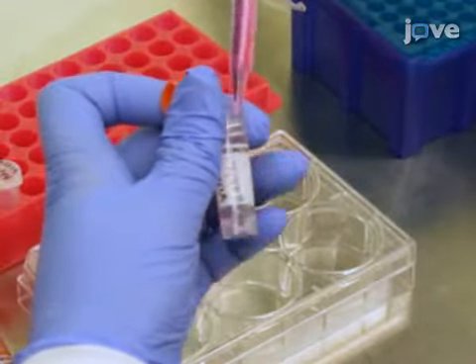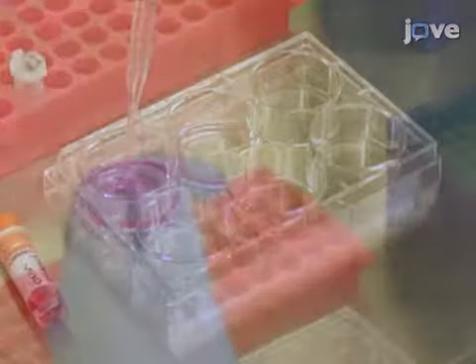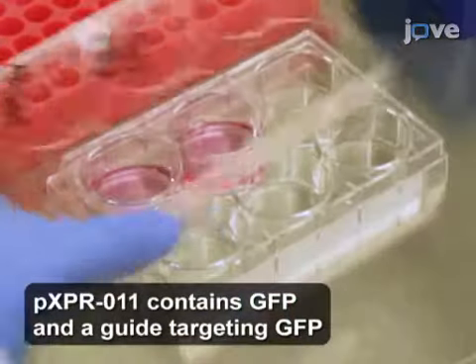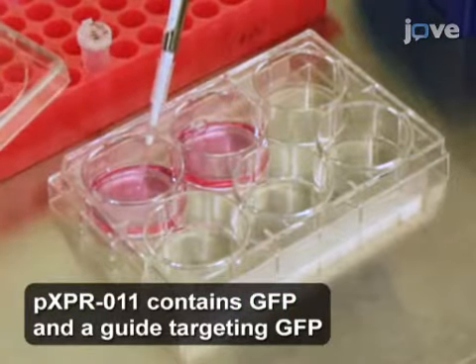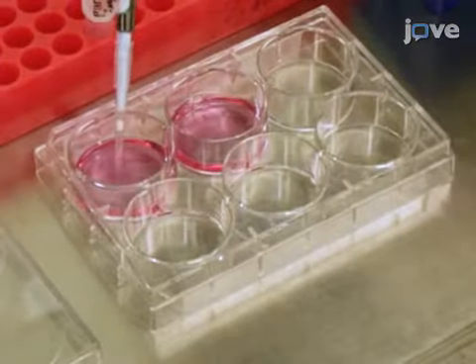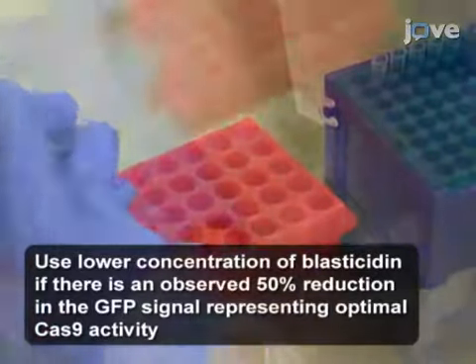Transduce the parental cells and the cells stably expressing Cas9 with the pXPR011 reporter construct through lentiviral infection. Continue selecting cells with 2 micrograms per milliliter of puromycin for 3 days, 48 hours after spinfection.